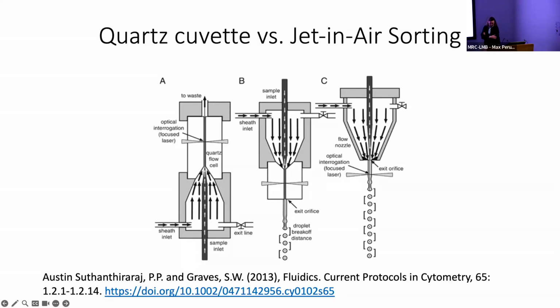Then the flow chamber and the flow stream essentially apply a charge to these droplets, and they will pass through a series of two electrostatically charged plates. Those droplets will then be sorted either to the right or left based on their positive or negative charges, or half charges or quarter charges.